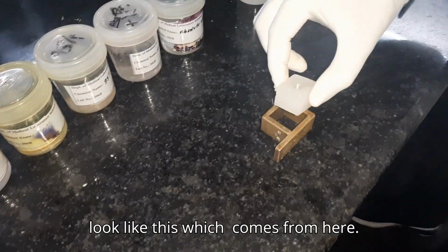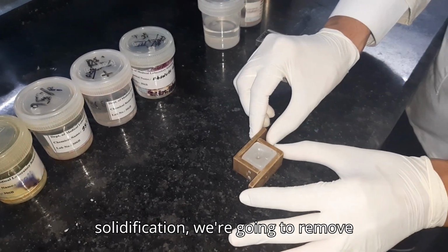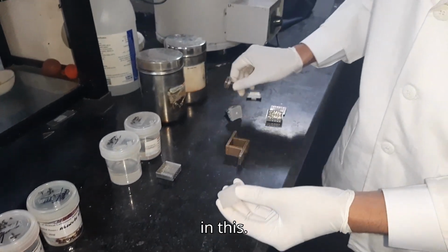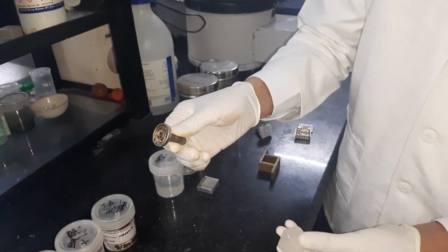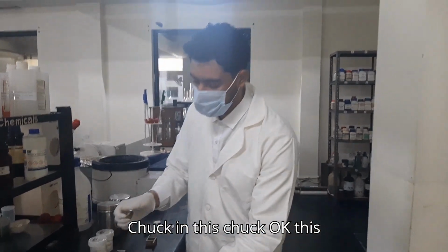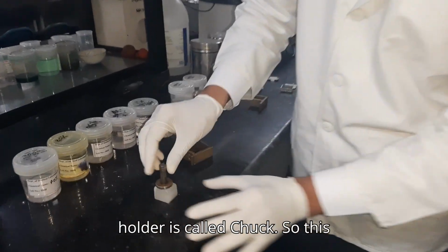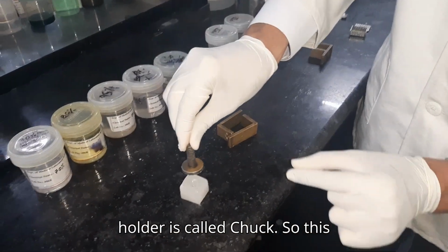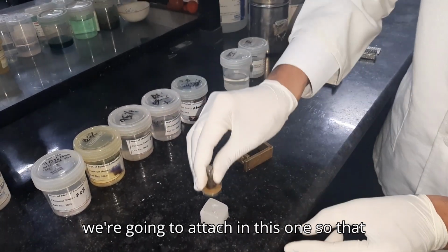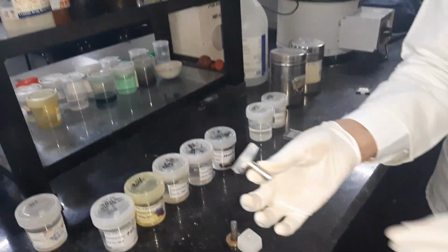At the end, the tissue will look like this. After solidification, we are going to remove the mold, and the tissue will be attached to this chuck. This sample holder is called a chuck. The block will be attached to it. The chuck must be hot. After becoming hot, we attach the block to it, so that it becomes like this.